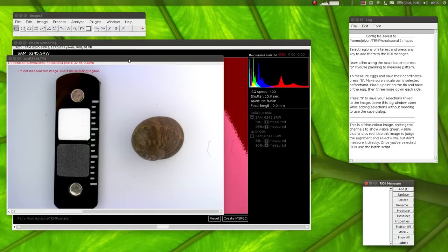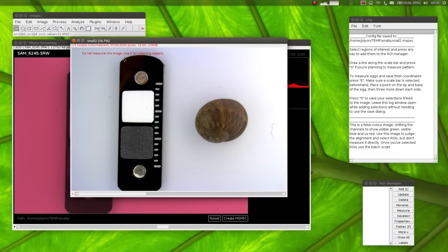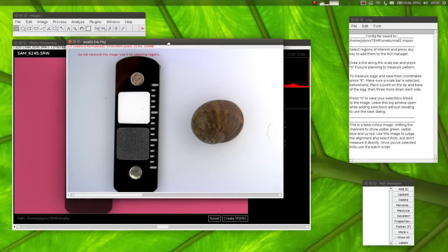Okay, so here we are with the false color image. There's just a warning that's come up telling you not to measure this image because it's non-linear. And it's showing false color. So here the false color means that we're showing the visible green, the visible blue, which is coming across as green, and then the UV red, which is being shown as blue.